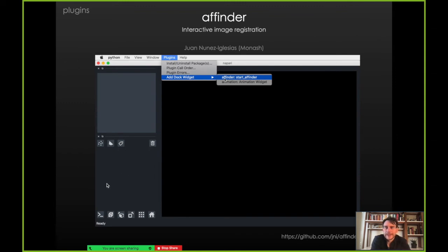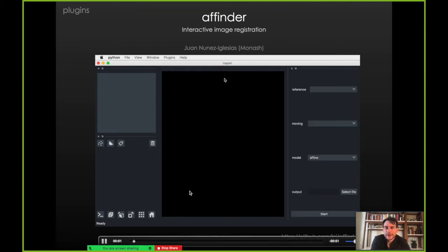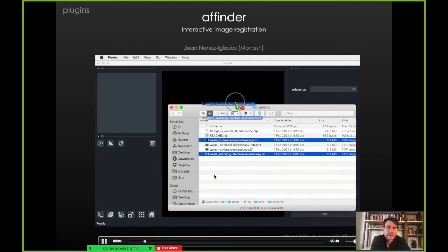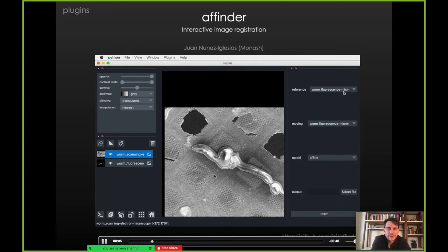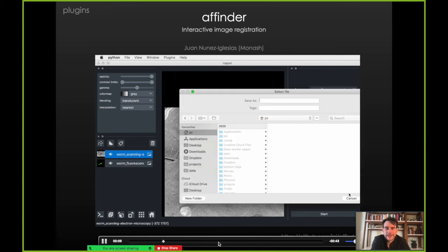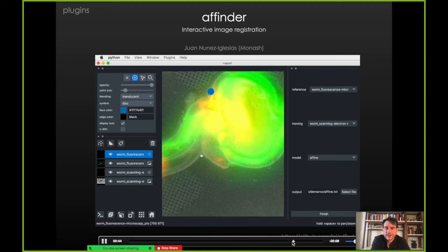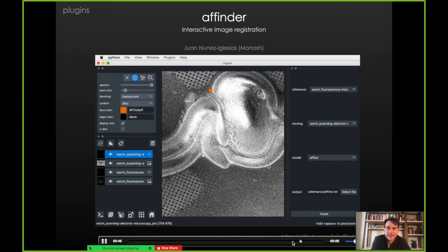Finally, on the plugins, there's Affine — an example of affine image registration from Juan Nunez Iglesias. You can load different types of images, select some control points, and that will lead to a registration that you can continue to edit and interact with.